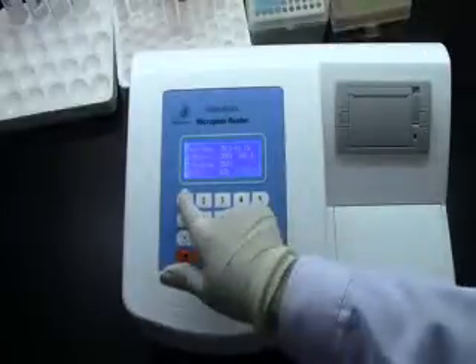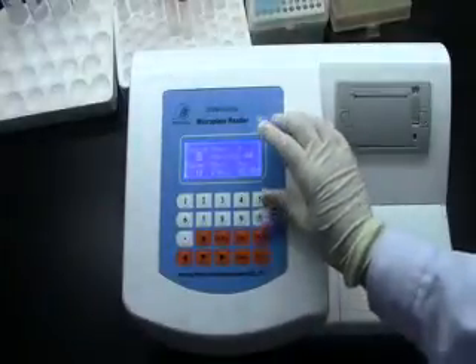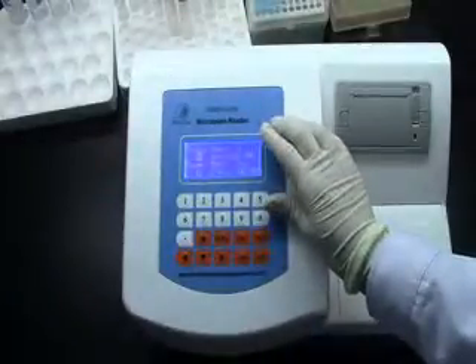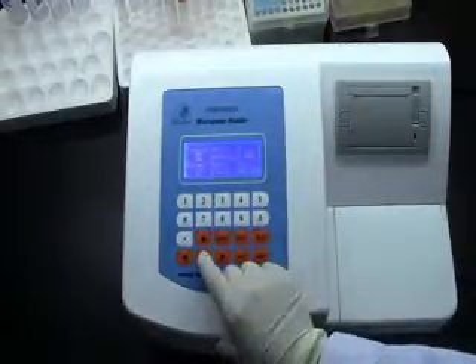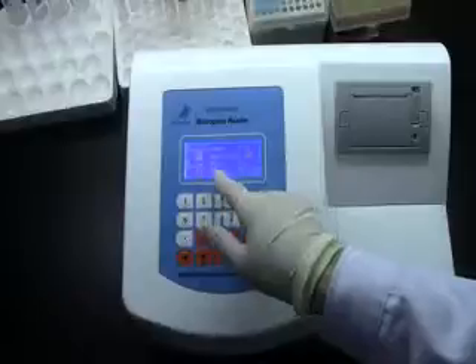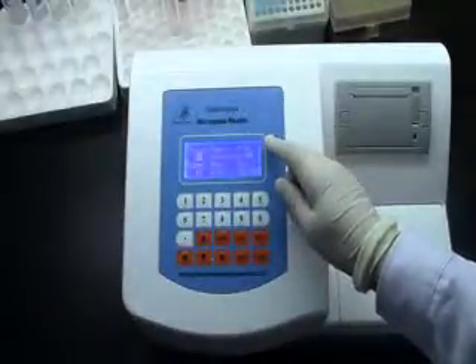OK, let's check it. Press 1 for detect. The 00 program name is blank. Press to scroll — 01, BTAA, is the program we just created.